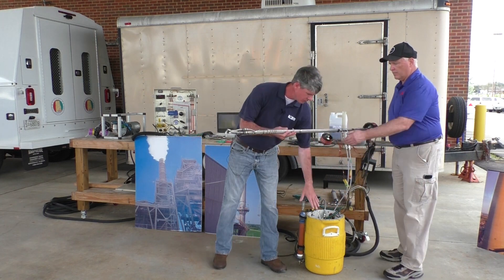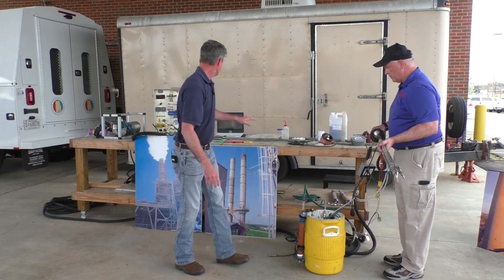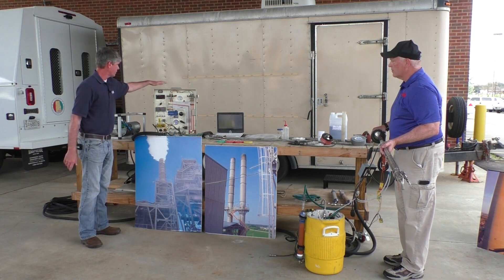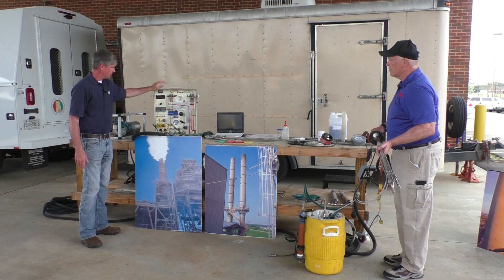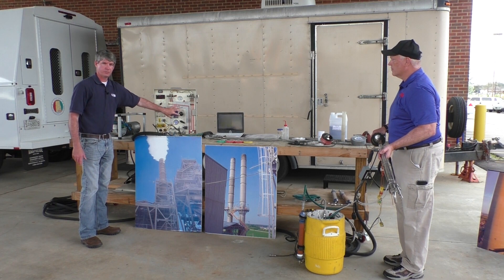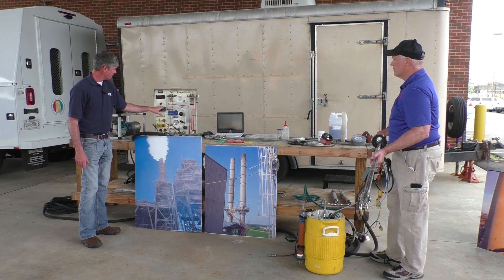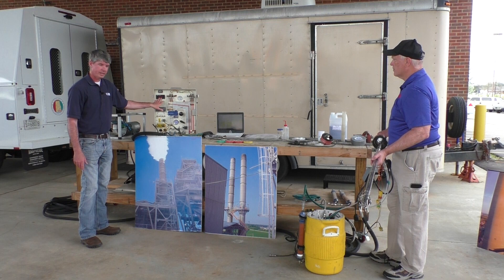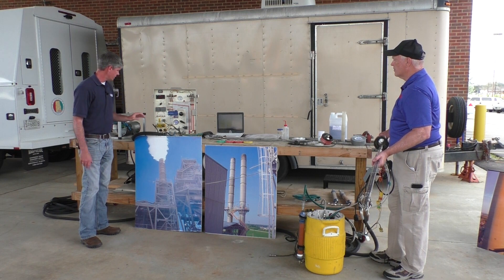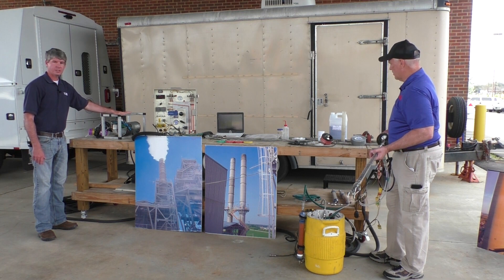Then our sample travels through our condenser, which is in the cooler. Then through our meter box. This box is where we can increase or decrease the sample flow. We can control our heat. We have a temperature readout and various other things. And then finally, we have a sample pump, which is a vacuum pump.